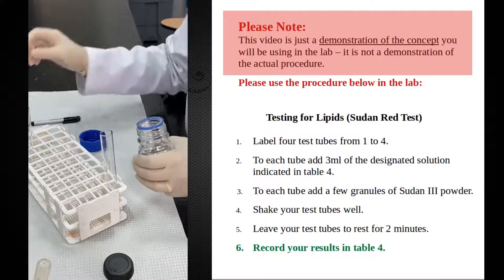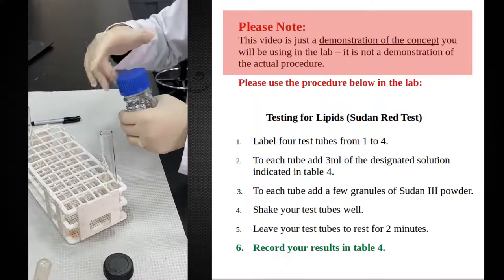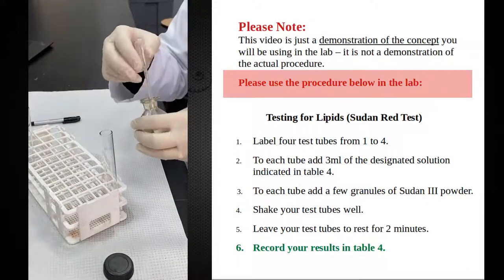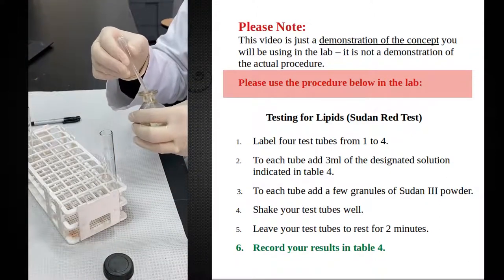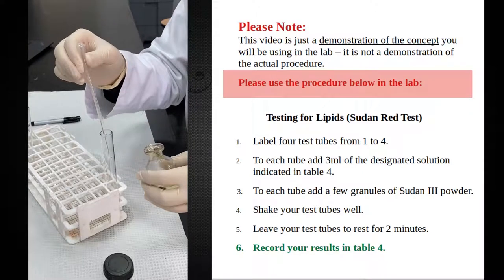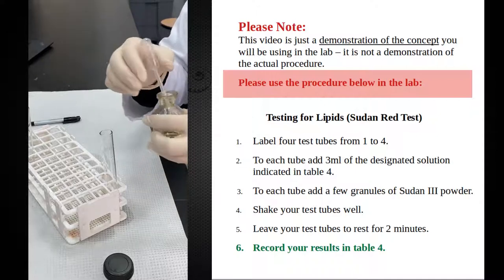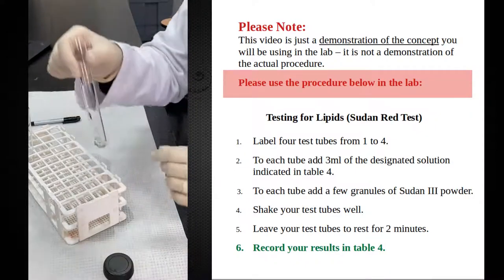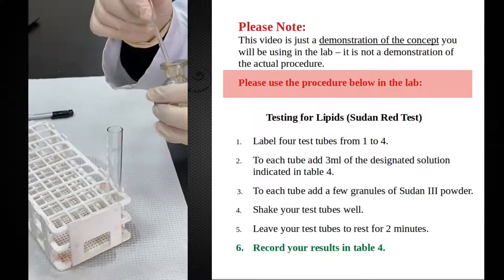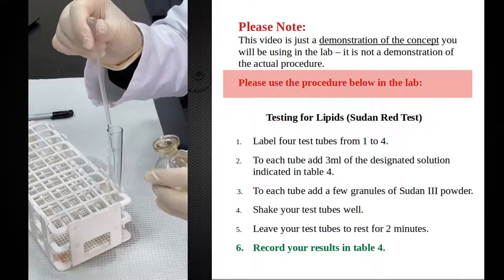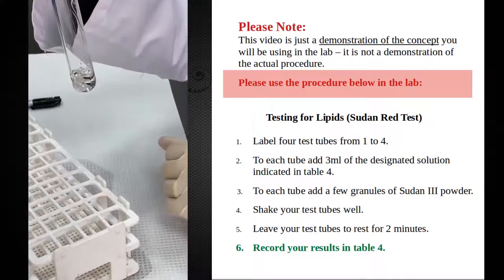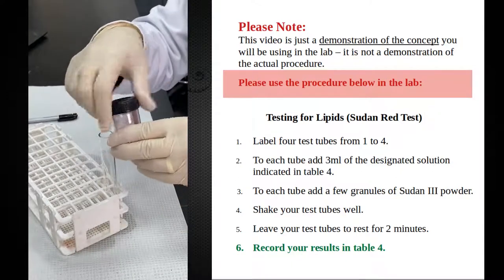As you know, the oil and the water won't mix — even if I mix them together, they will get separated. This is a bigger dropper pipette, so these are 3 ml. I will add a little bit more oil so I can show you the phases totally separated. So water, oil — I will add to this mixture a little bit of Sudan powder.